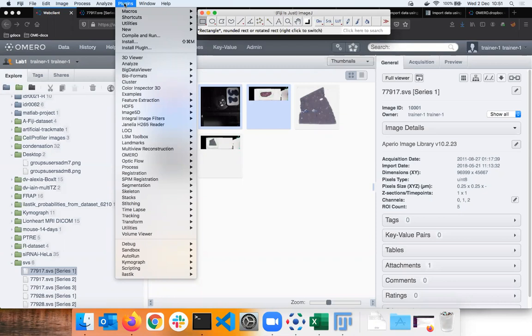So step one, I get my image out of OMERO into the Fiji environment, do my magic with Fiji on it, some analysis producing regions of interest, measurement tables, and new images, and put those things back to OMERO to an appropriate place. How do I do that?